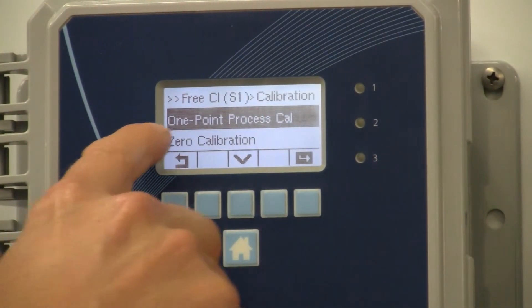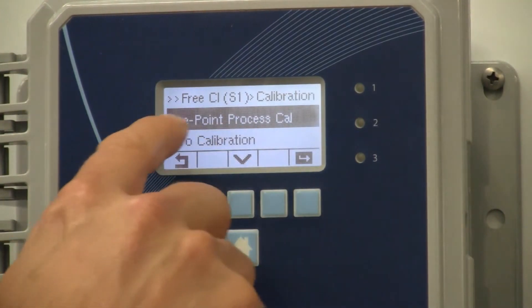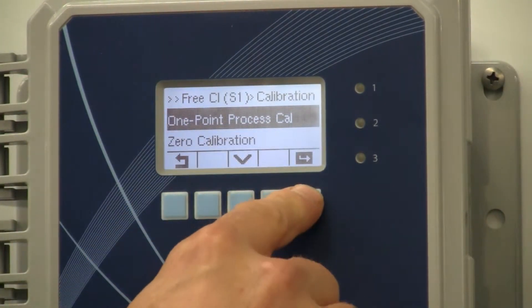You can do one point process cal or zero calibration. We are doing one point process cal — enter.